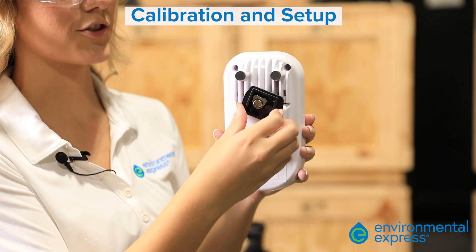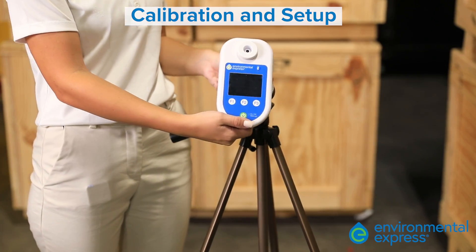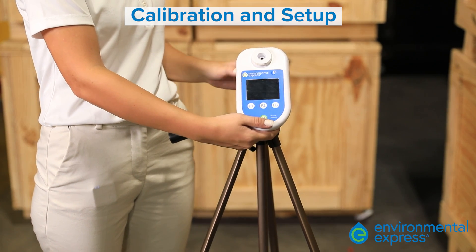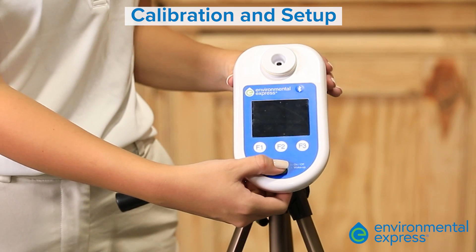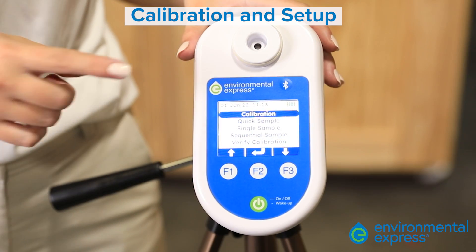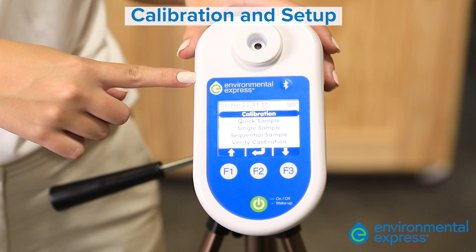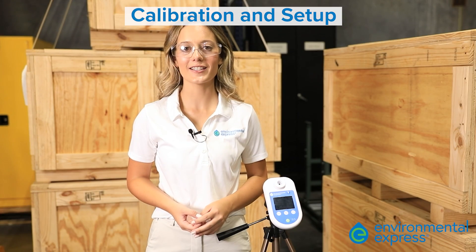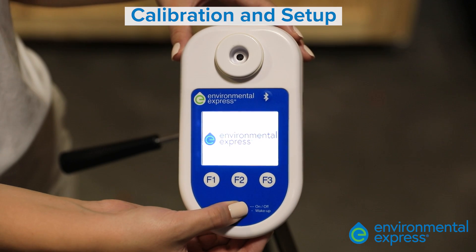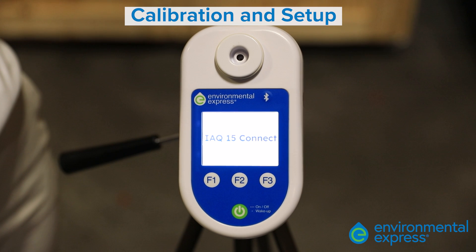Screw in the tripod accessory into the back of the pump. Mount the unit to a tripod for optimal stability. Power on the unit by pressing the green power button. At the top of the IAQ15 Connect, you'll see the Environmental Express logo. For those who are not aware, Zeffon is now Environmental Express. The Environmental Express screen will be followed by an IAQ15 Connect title screen and then the home screen.